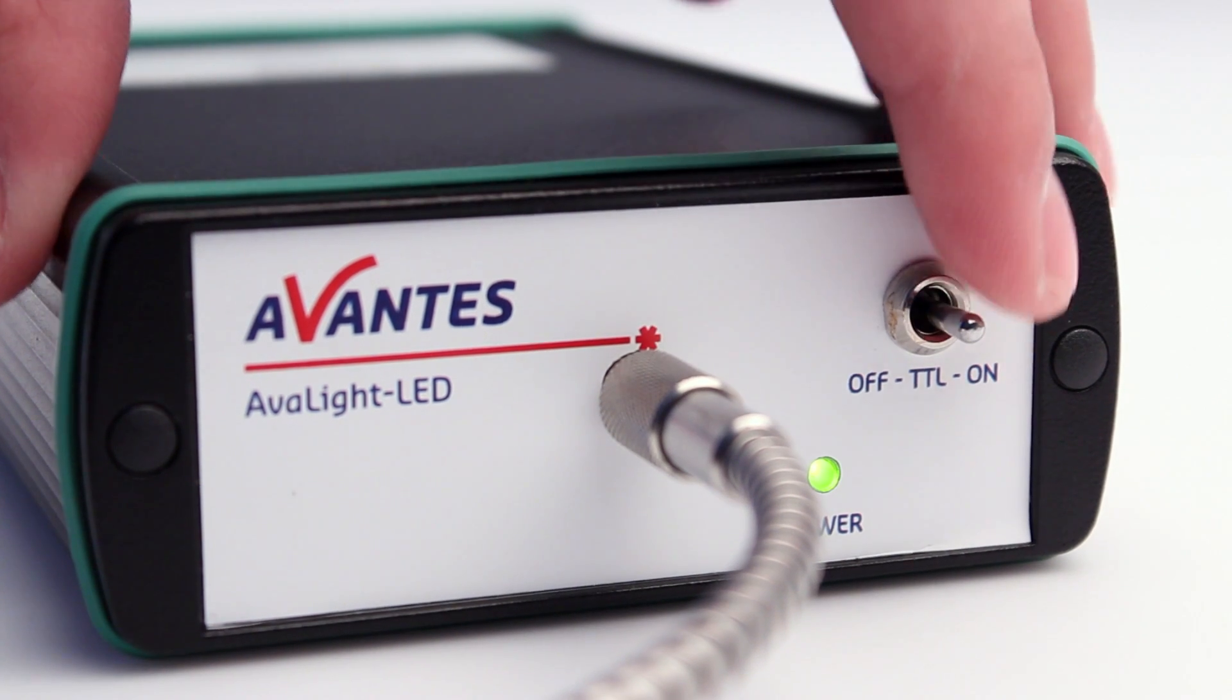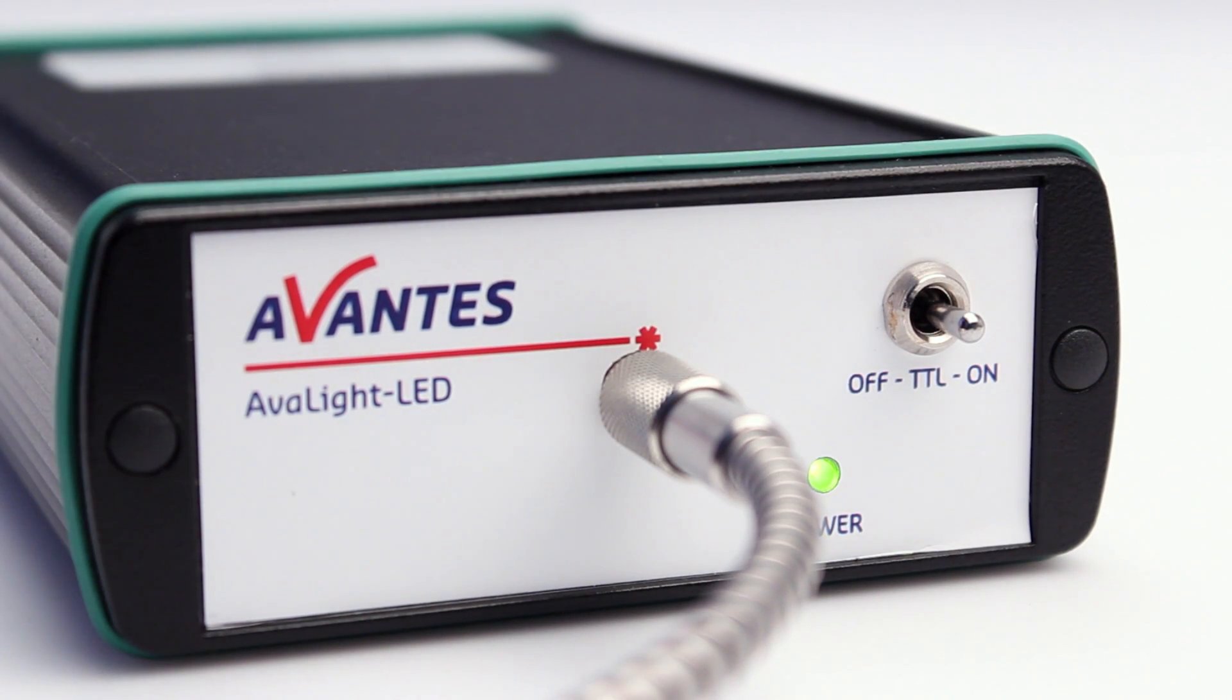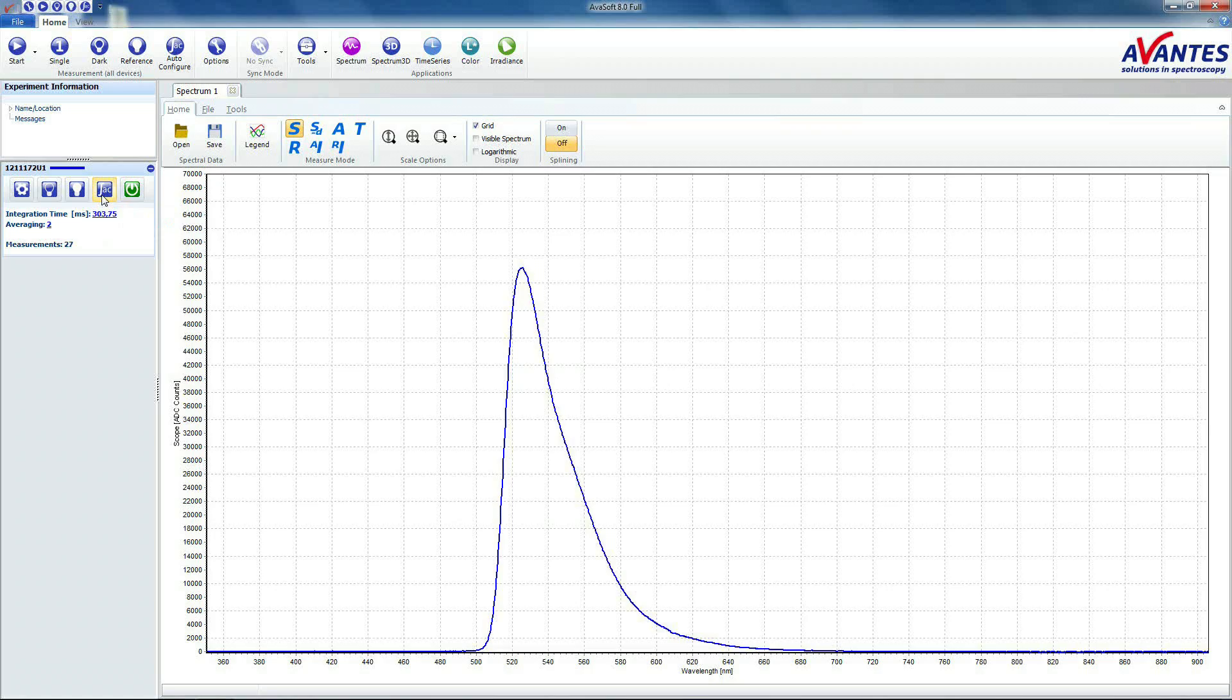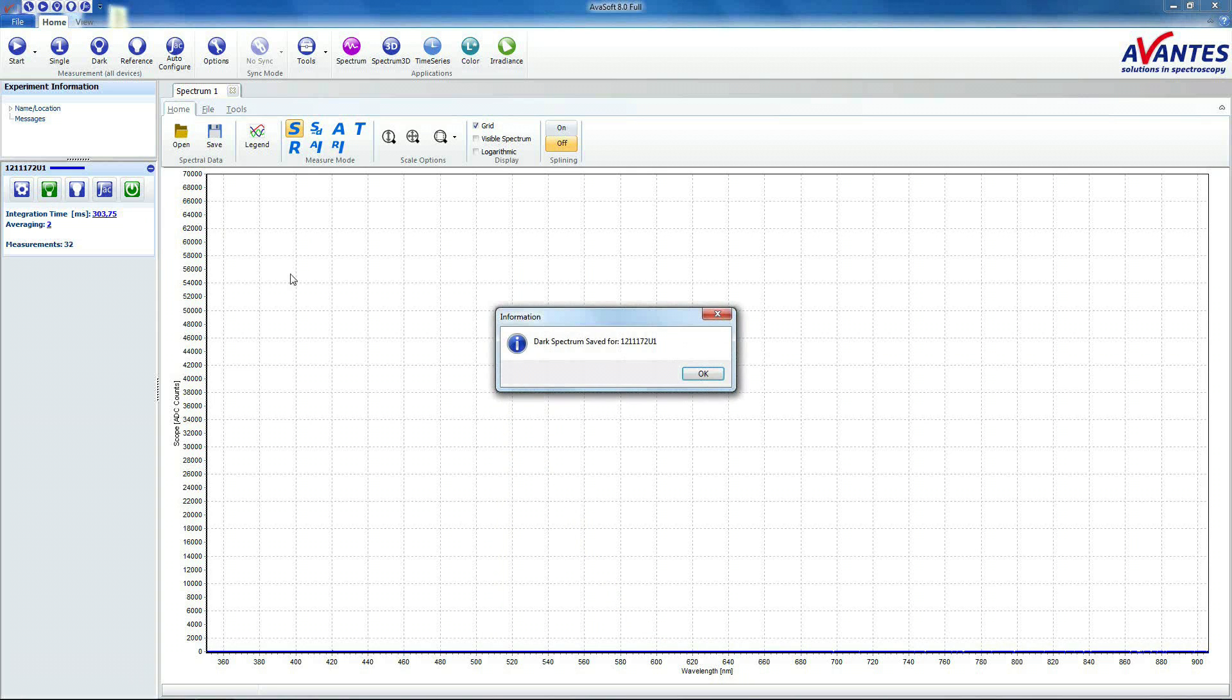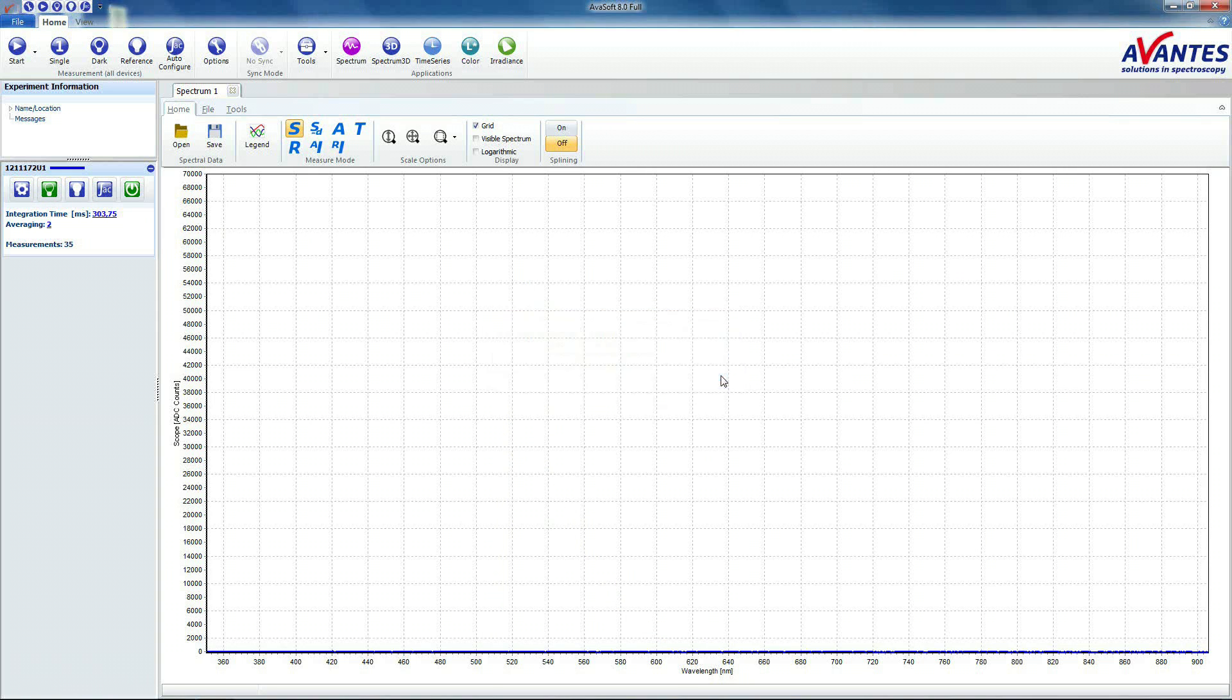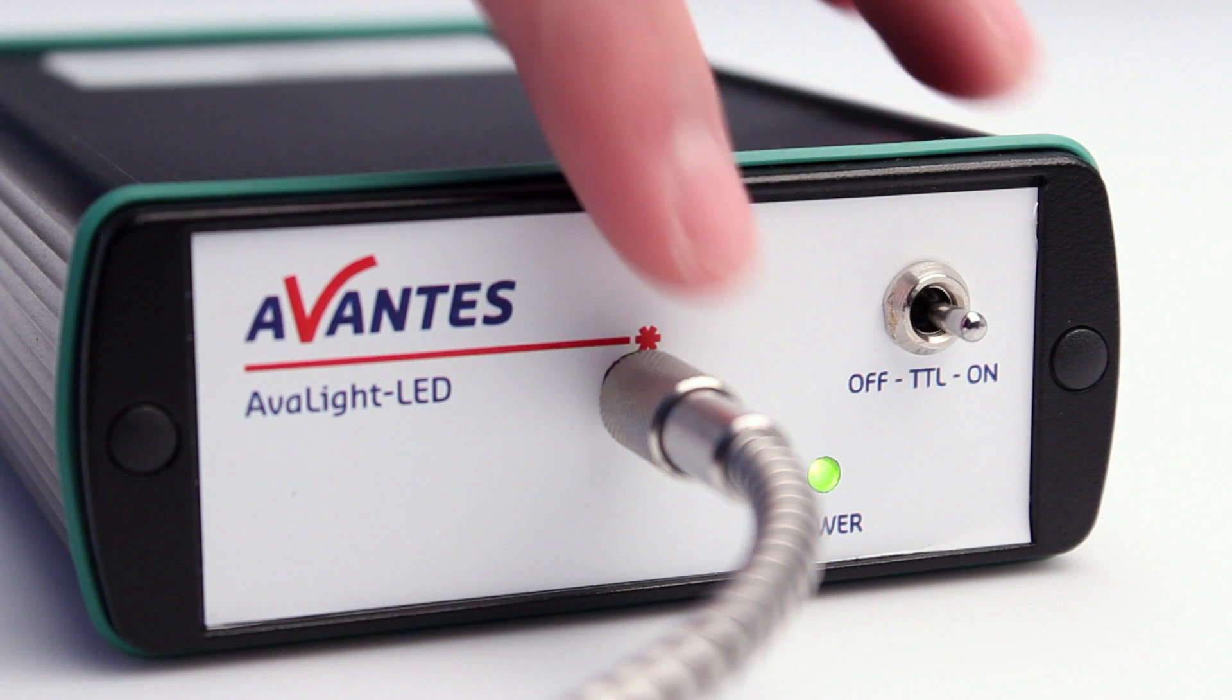Turn off the lamp. Take a dark reference. Please turn on the lamp.